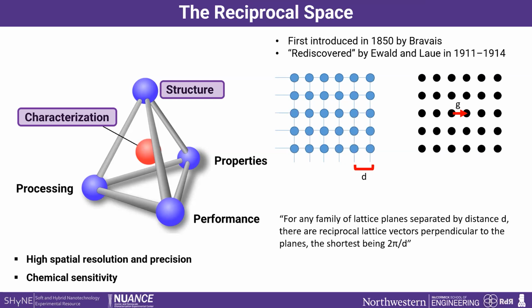And on the other hand, the basic tool to study crystals is the diffraction pattern, at least in my opinion. It is diffraction regardless of the wavelength, so it's like a wave, and it is also applicable to X-rays, for example, right? So you have a diffraction wave with a wavelength of a similar order of magnitude, and then the operation that transforms the direct space into the associated space, the reciprocal space, is what you want to observe through analyzing diffraction spots, right?